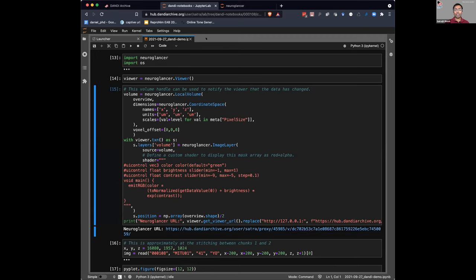So I wanted to put it out there because I know some folks in the audience are interested in how NeuroGlancer might kind of connect to the visualizations of things. And now you have an example that's in the notebook that you can play with and extend in all kinds of ways that you are interested in. I will say I tried running this visualization on a different level, and you'll have to get out of the default setting that you're currently using for your server option to create a larger memory option to be able to use this for a higher resolution sample.